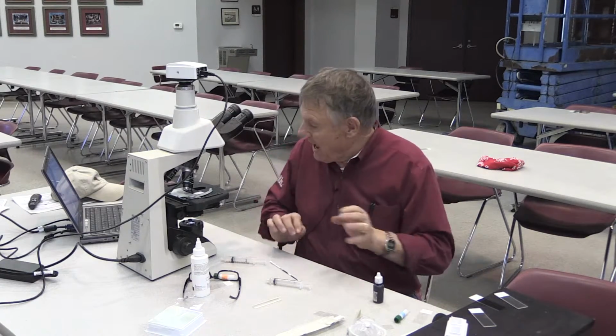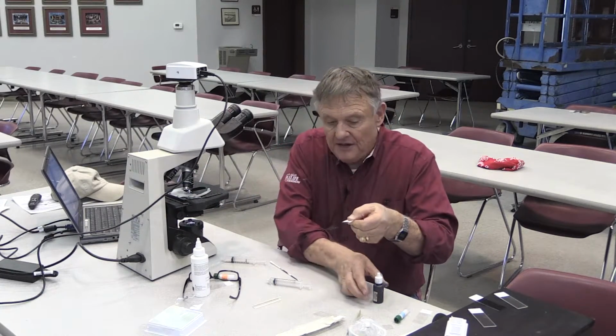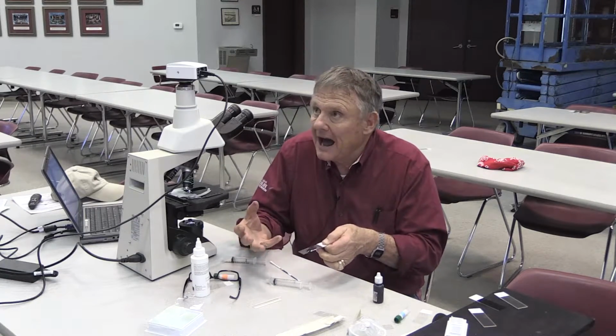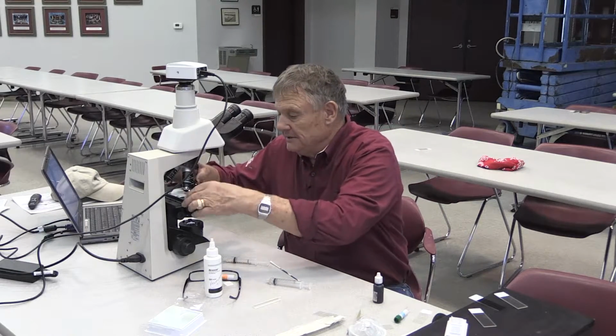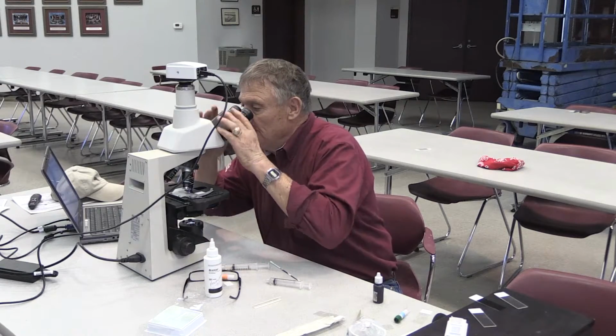Then once it dries, and this is what it will look like after it dries, usually we look at this under oil because we're looking at it at a higher magnification. So we put just a little drop of microscope oil, immersion oil, on there, and then look at it under the microscope.